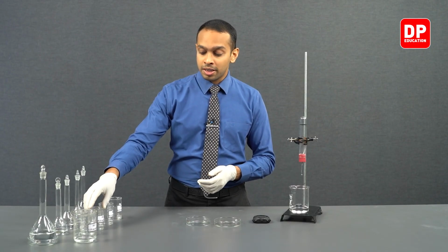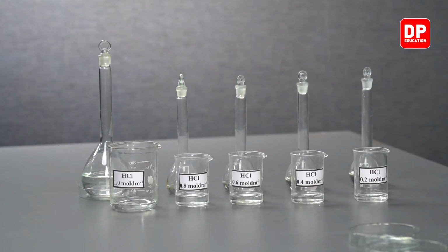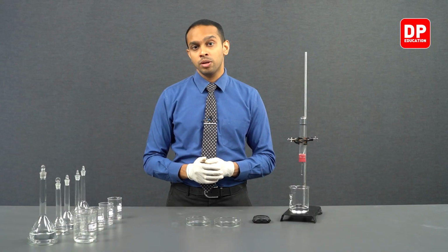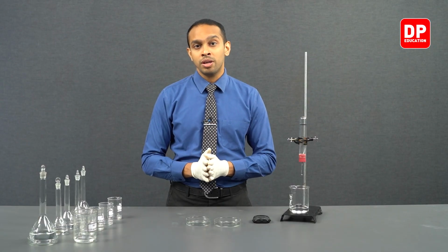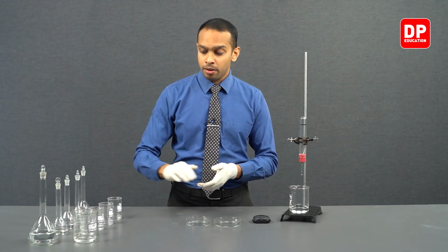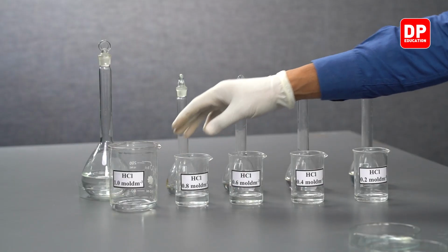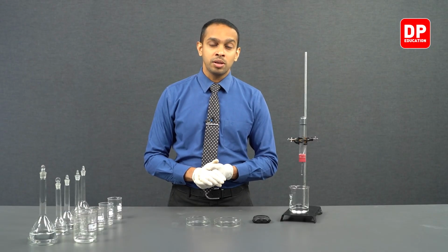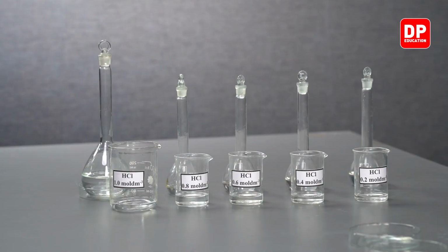And then when it comes to our third experiment, when we reacted HCl that has a concentration of 0.6 moles per decimeters cube, it took less than 30 seconds, around 27 seconds. When it comes to our 0.8 moles per decimeters cube concentrated HCl, it took around 13 seconds.